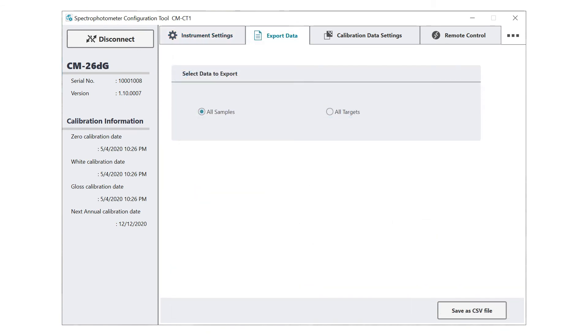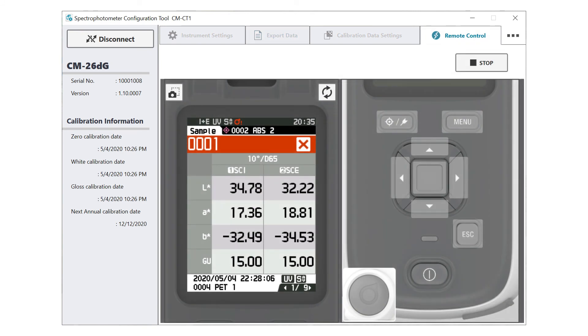In addition, this tool will assist you in exportation of the saved data, such as to a CSV file, as well as having a remote control feature, which is very useful for remote troubleshooting of the instrument.